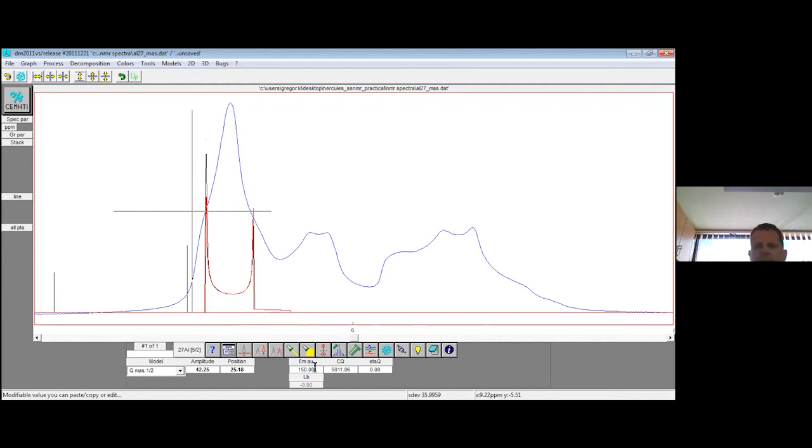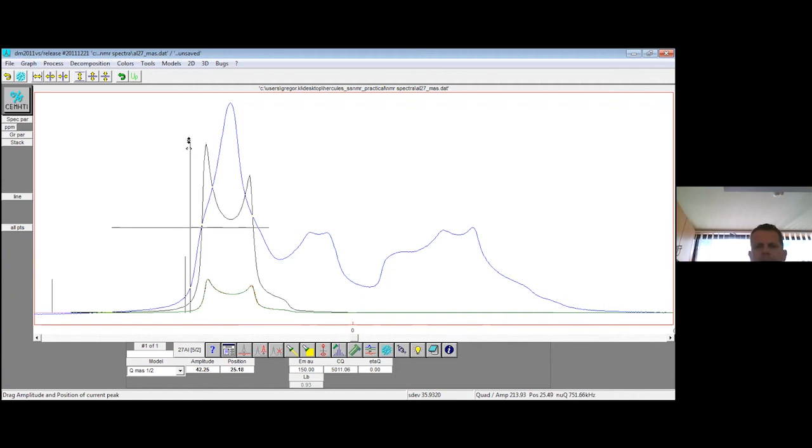Try this. The magnitude of this parameter is sometimes difficult to estimate. You try it, enter some value, push button, calculate, and then you have what you have. Now, okay, we have some broadening, which is probably still not enough. We will increase it a little bit, let's say to 250. Perhaps this will be too much, but the shape is still way off.